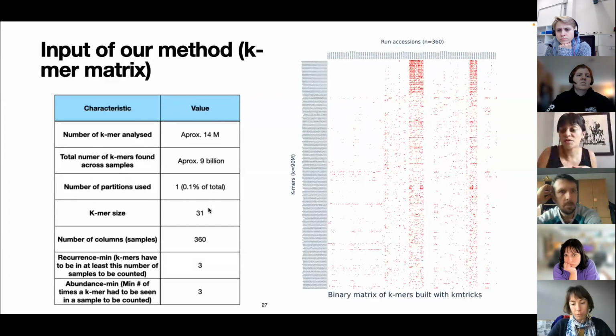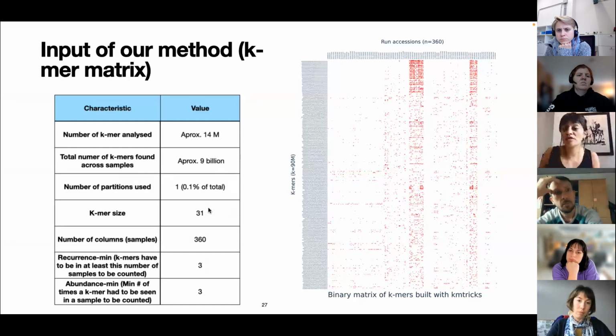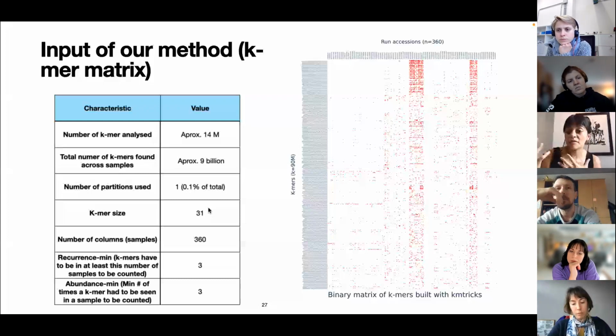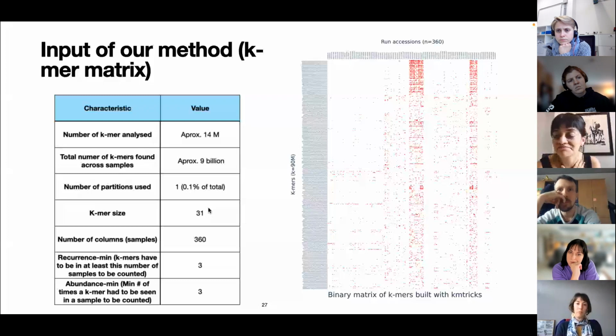Let's say I'm much more interested in counting the ancient oral stuff, and not taking into account the other, then you could weigh the counts and change the proportion. No, I haven't done any type of normalization. I guess that would be something worth comparing. But again, the matrices are different, right? What decOM works on is a binary k-mer matrix, and the other table, which is also used by Source Tracker, is an OTU table, right? With counts. So it's not binary.